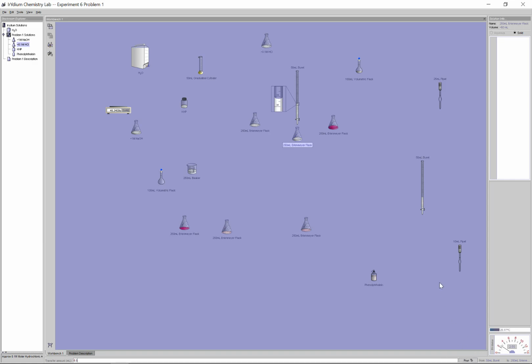So I'm going to pour in, let's say 0.5, 0.5, 0.5, 0.5. Let me just add it in maybe 0.2 at a time for the next. So keep pouring it in. I'm looking for the palest pink color. That one might even be overdone, but it should be a little bit better than the first one. I'm just going to take down some volume reading here. I'm between 36 and 37, maybe here, 36.62. Again, I don't have enough, so I'm going to need to reload this burette here for the third trial.